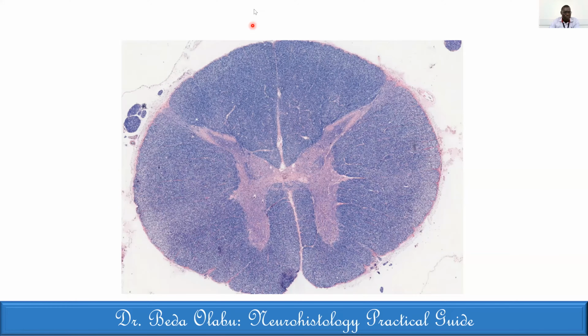Any volunteer? Yes, Mokaya. Looking at this section, we have more of white matter tracts than the gray matter.